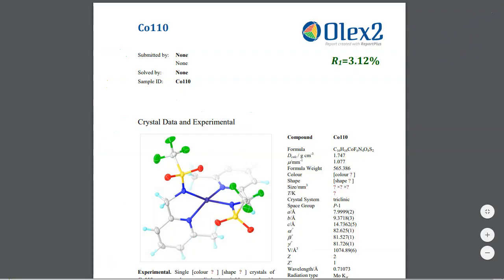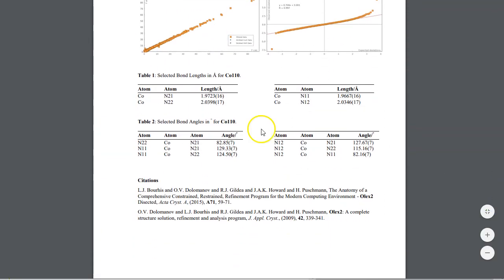You don't get all the bond distances and angles, but only the ones that you were interested in. Thanks for using Olex2.